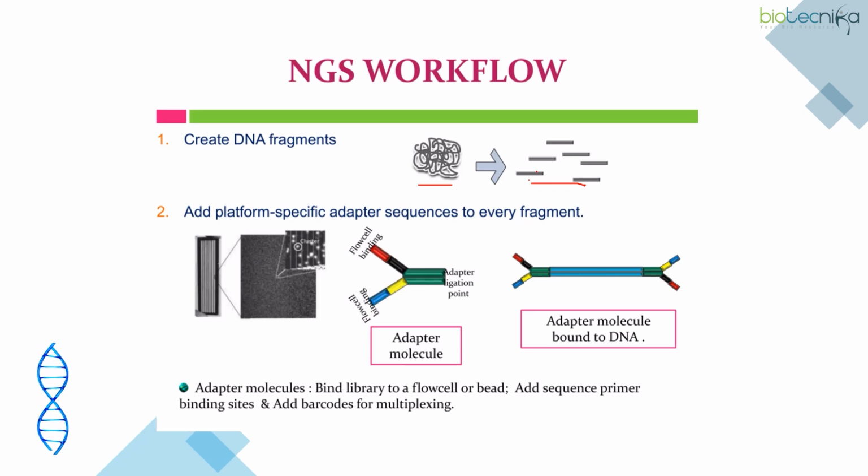So this specific adapter sequence is nothing but molecules in the binding format. And once the adapter molecules are bound to the DNA, those adapter molecules bind libraries to the flow cell or the beads, right?